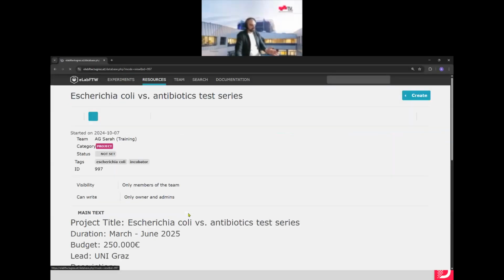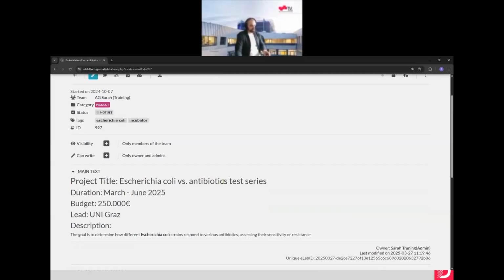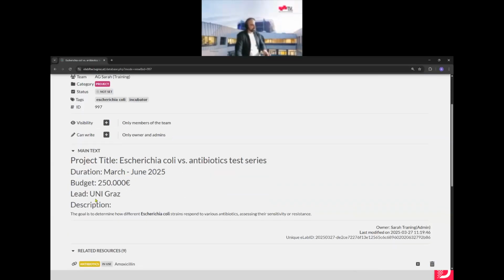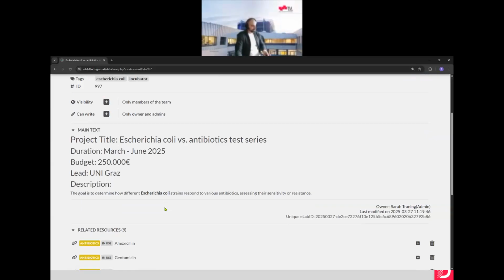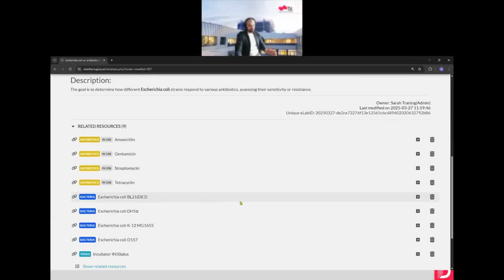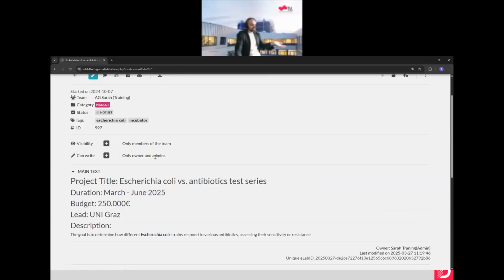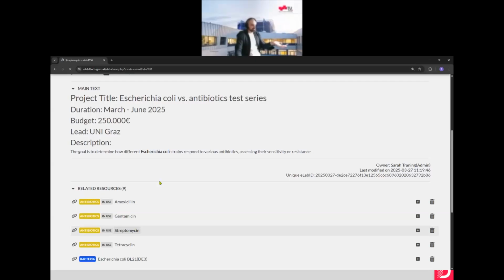And I can check this out, and I can see, okay, there are different information here available. Like now, it's pretty much the same like before, because it was downloaded as a set of entries. They are still connected to each other. So still, I can go there and experience all of these entries.